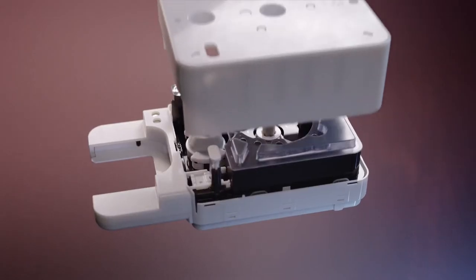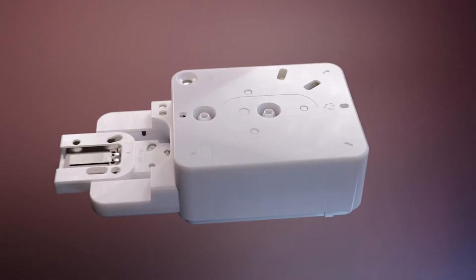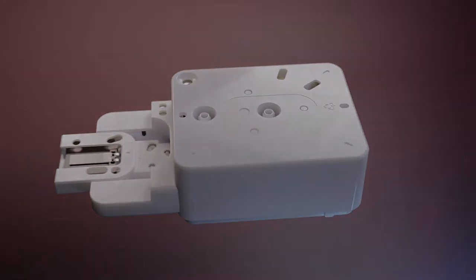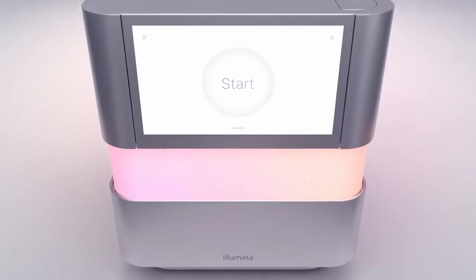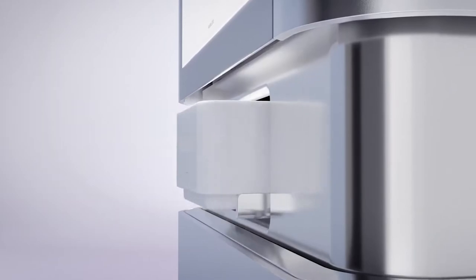Most components of the NETSEQ 1000-2000 reagent cartridge can be recycled, depending on your local solid waste recycling guides. Check with your local solid waste recycler or your municipality's specific instructions for recycling of these plastic parts. Follow the steps shown in this video to disassemble the reagent cartridge for recycling.